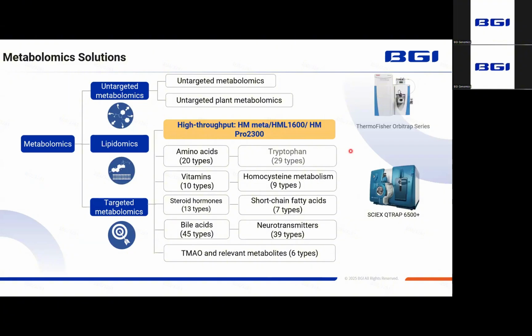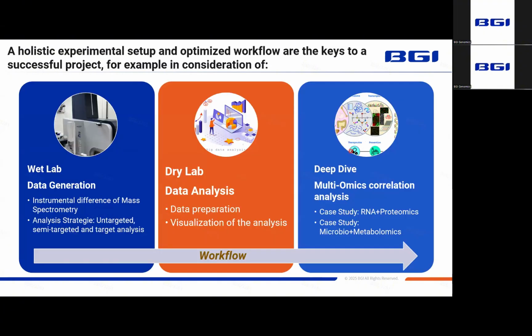Okay, I have given a short summary of the untargeted and targeted panels we have. You are welcome to send your wish list to us and we can combine panels for you. The second part, we move to dry lab, the data analysis.